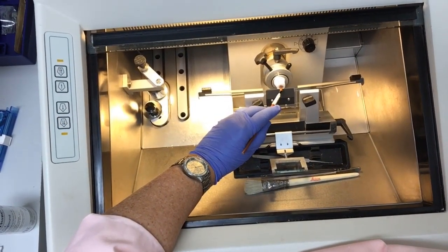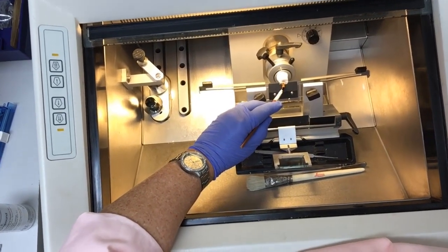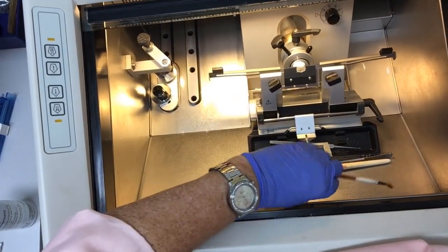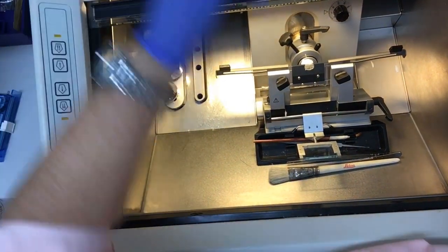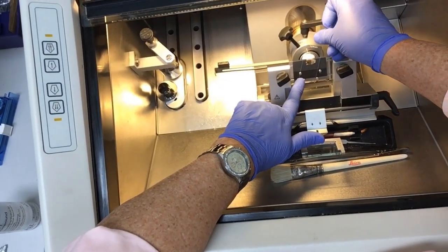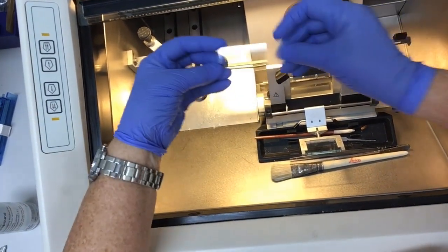Next, the frozen tissue is sectioned, usually at 6 microns. This technique takes a lot of practice. The frozen section is then mounted onto the glass slide. The mounting medium that was supporting the tissue sample rapidly melts on the warm slide and adheres the frozen section in place.